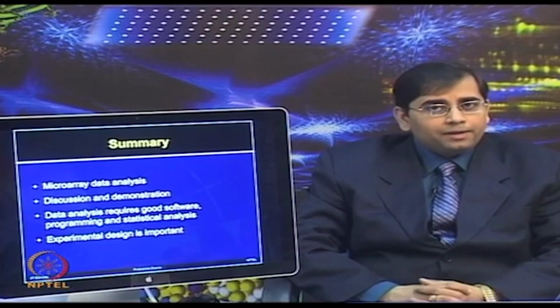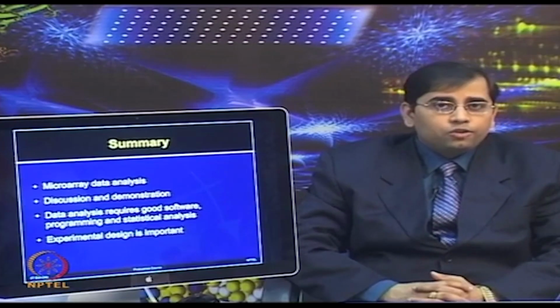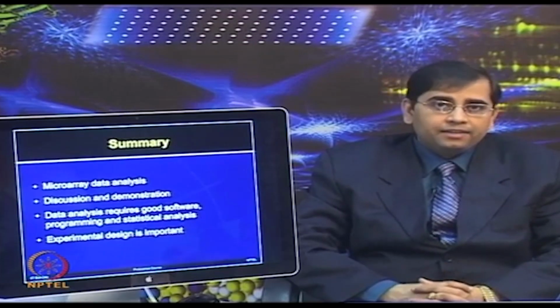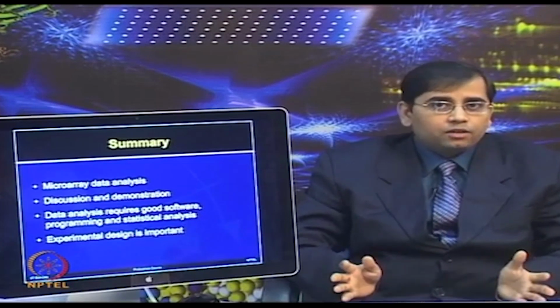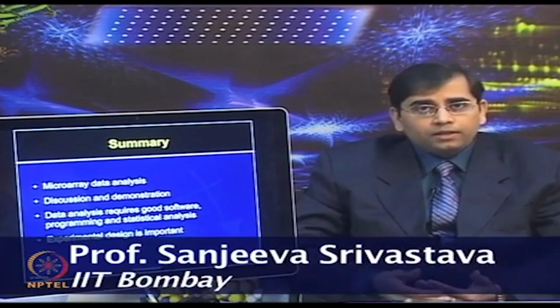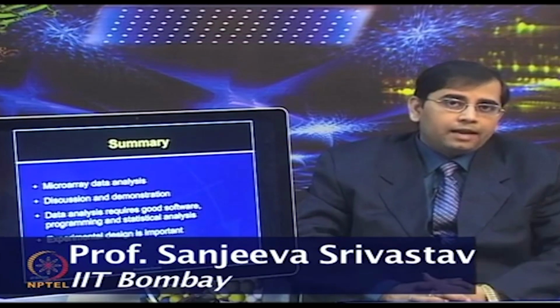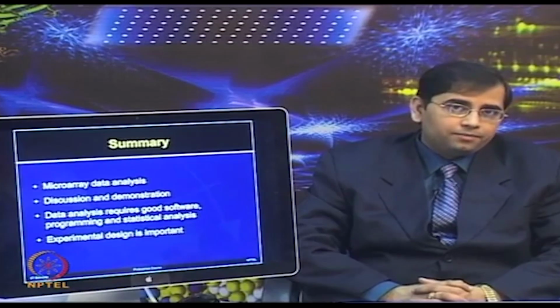So, microarray experiments generate high throughput data. They provide you information on thousands of features in a very short time, but it becomes very challenging to analyze the data, especially when you have to compare various slides from different experiments, and you have to normalize and treat them equally, so that you can compare all the slides on the same platform. So careful image processing and data analysis becomes very crucial in microarray based experiments.